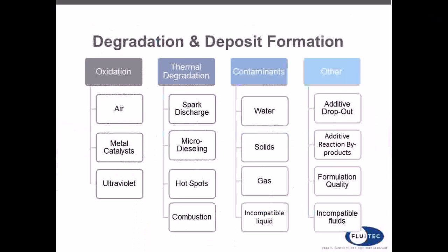And then my favorite category is maybe the other category, where I just have 4 here, but you could have a wide range of other reactions that can cause the fluid to degrade and form deposits. So additive dropout could be one, additive reaction byproducts. Sometimes we've seen issues with formulation quality. So this could be a wide range of various other mechanisms as well. I would say this is just a quick snapshot of some of the different ways that fluids will degrade.